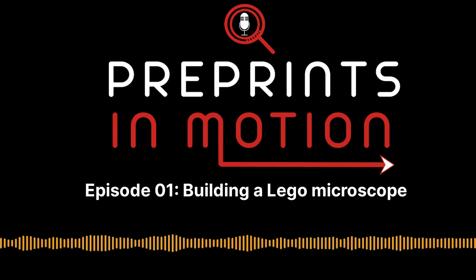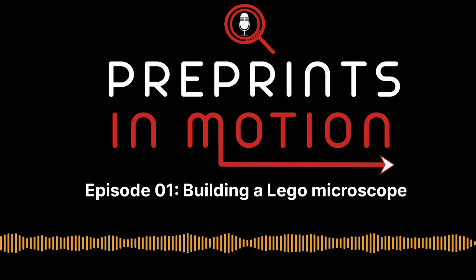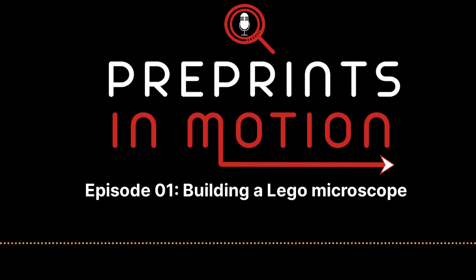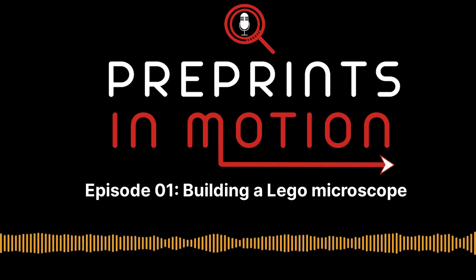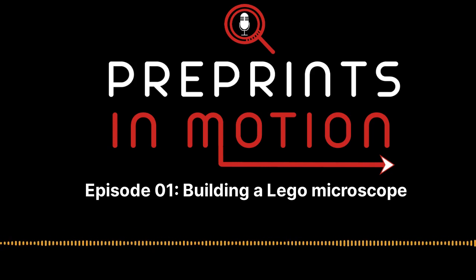So, you built a Lego microscope. Could we see a Lego lab in the future? Could you build other stuff out of Lego, like a Lego spectrometer, for example? Because it's kind of the same principle. In the end, there are labs that use Lego in actual working setups. There's a lab in the UK that has several setups that incorporate some Lego parts. In the end, Lego also has its limitations. At some point, if you want to really push the boundaries of science, you have to step away from plastic bricks. But I can very well imagine that something that combines education with science uses Lego.